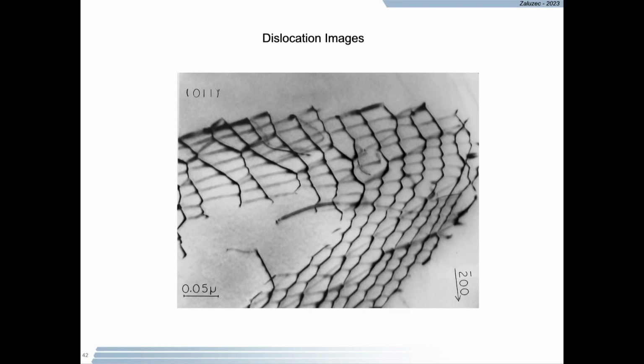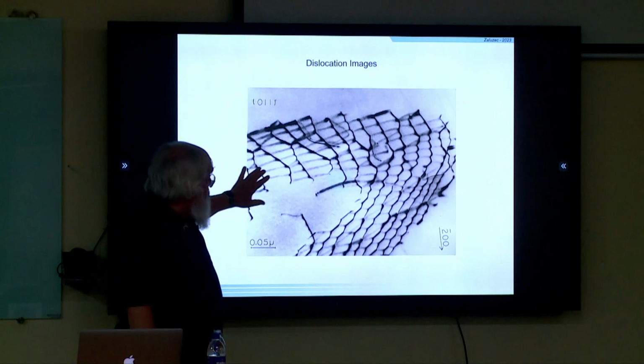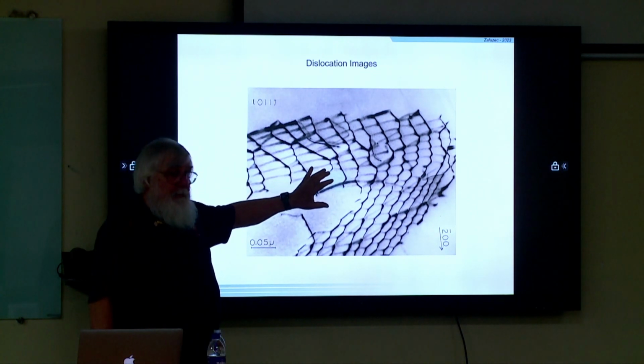I'm going to skip most of the material on diffraction contrast, because that's some of the material that Hamish is going to talk about. I mentioned diffraction contrast, and I bring up just a couple of examples to show you.